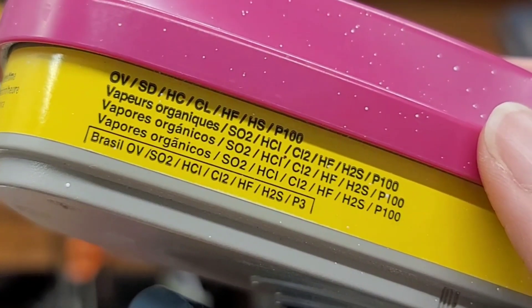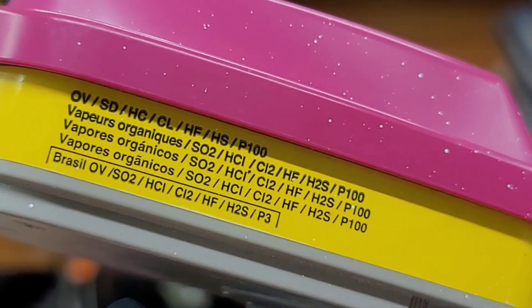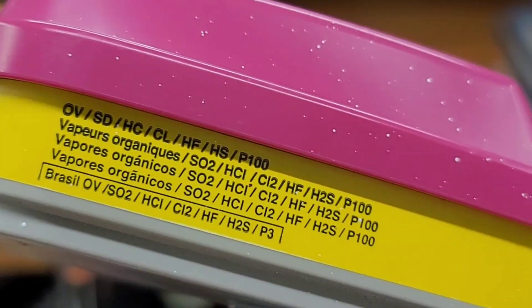Here's a close-up of that cartridge. It protects against organic vapors, sulfur dioxide, hydrogen fluoride, chlorine gas, hydrogen sulfide, and non-oil and oil particulate matter.